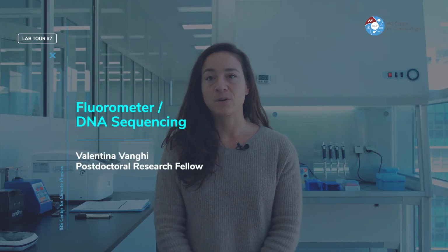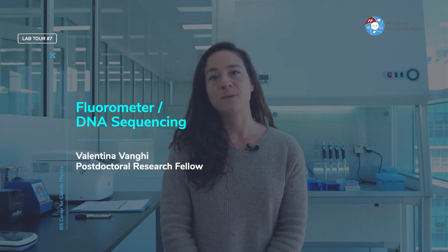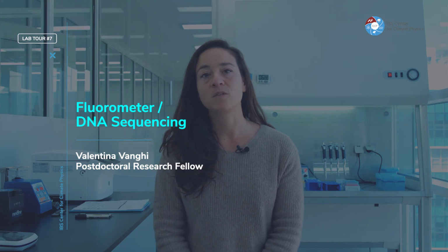Welcome to our small ICCP metagenomics lab. My name is Valentina Vanghi, and the goal of my research is to link cave environments with different biological taxa that grow inside or outside the cave, such as bacteria, fungi, or plants. Eventually, we would like to expand this research to extract paleo-DNA from stalagmites and link past climate with biological changes.